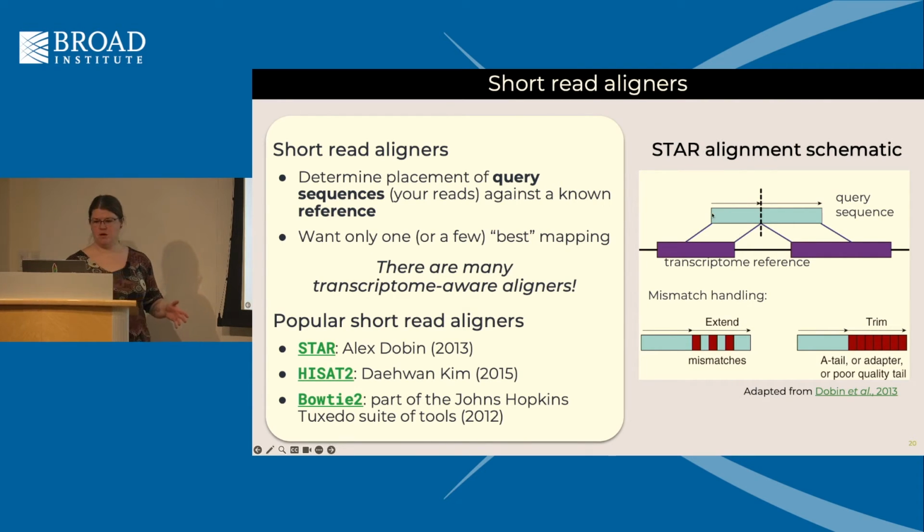Just a little bit on the STAR alignment schematic. Here's your query sequence. And STAR allows you to do things like, say, this part of this read aligns to this exon, and this part of this read aligns to this exon, things like that. You can do gapped alignments.